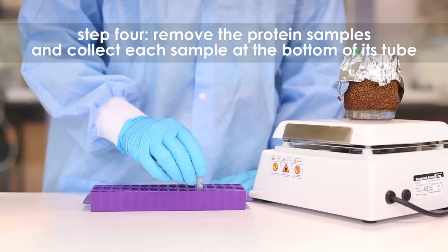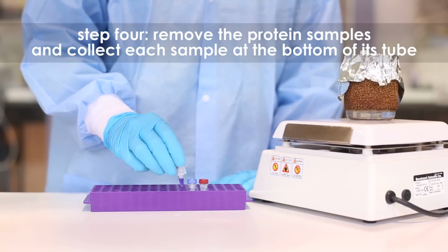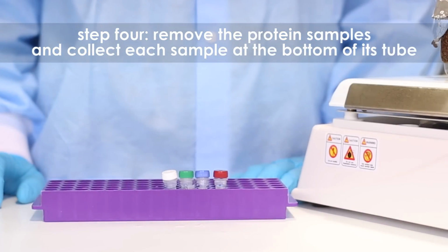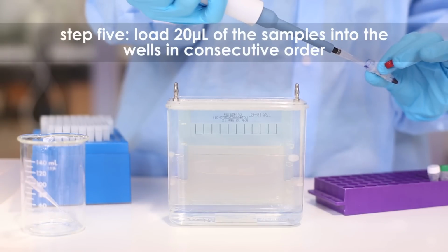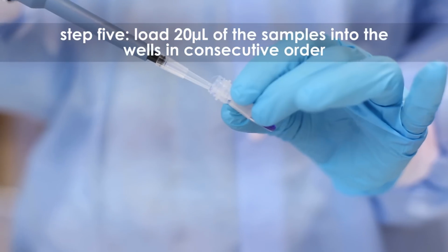Step 4. Carefully remove the protein samples from the boiling water bath. Collect the sample at the bottom of the tube by centrifuging or by gently tapping the tubes on the tabletop. Step 5. Load 20 microliters of the protein samples into the wells in consecutive order.